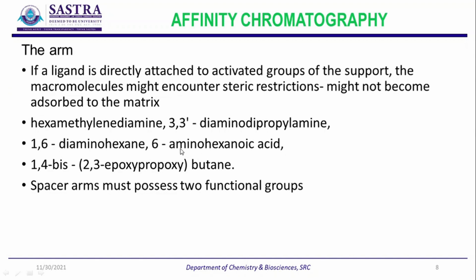Some of the chemicals used as spacer arms are hexamethylene diamine, 3,3-diaminodipropylamine, 1,6-diaminohexane, 6-aminohexanoic acid, and 1,4-bis(2,3-epoxypropoxy)butane. Your spacer arms must possess any two functional groups.